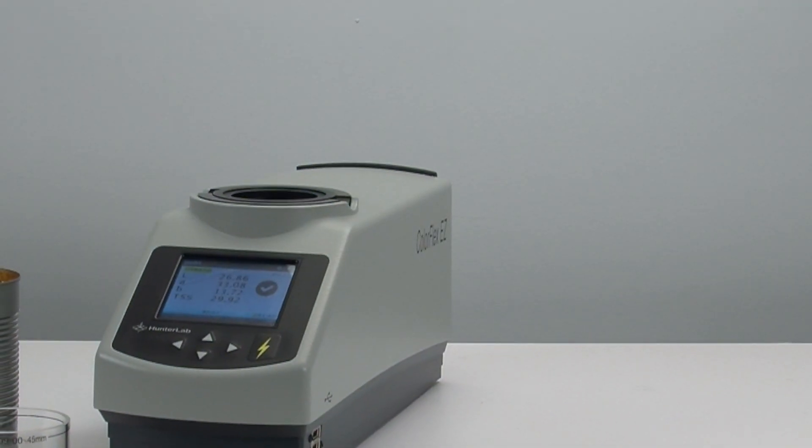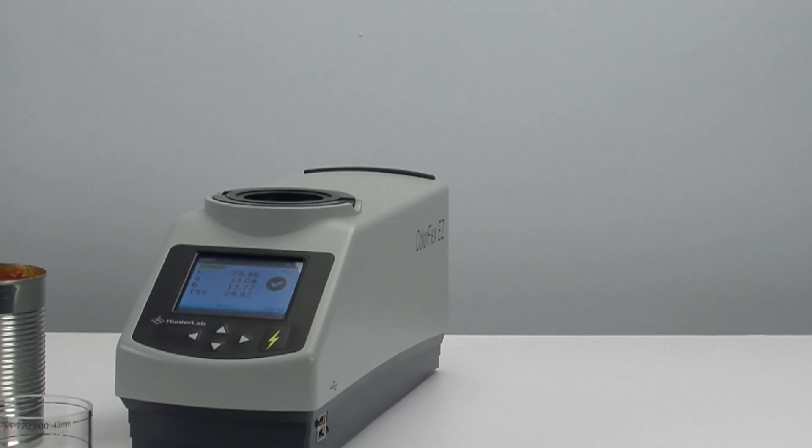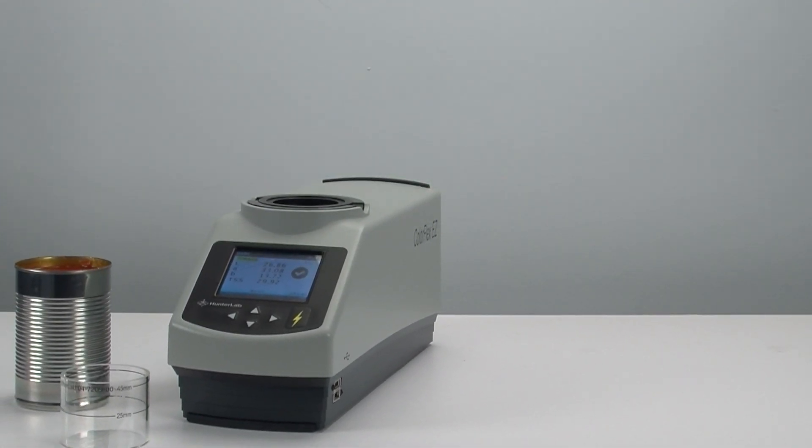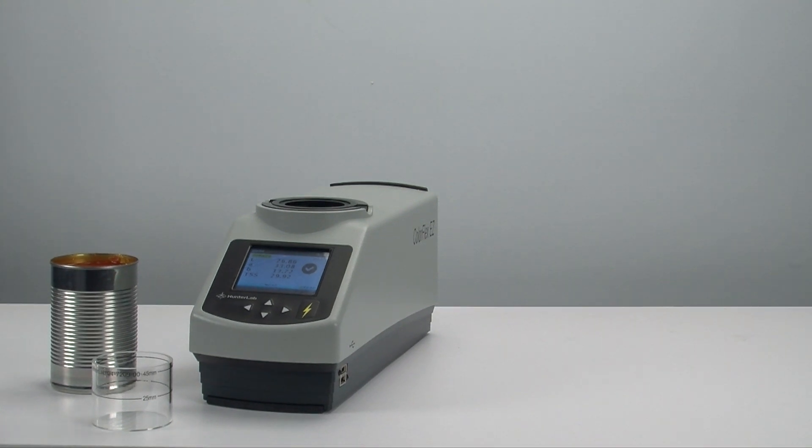Let's see just how easy it is to measure the color of a tomato sauce sample. This is generally a three-step process using the Hunter Lab tomato product setup.